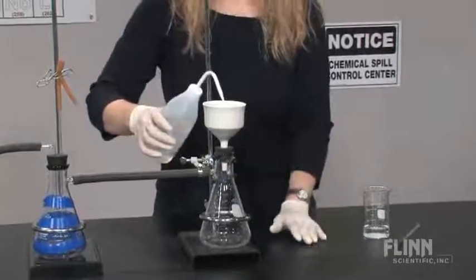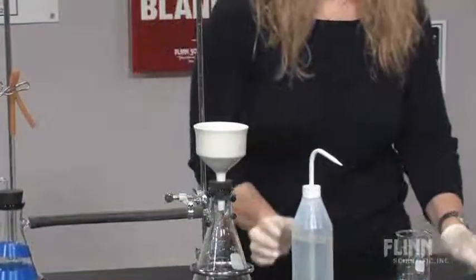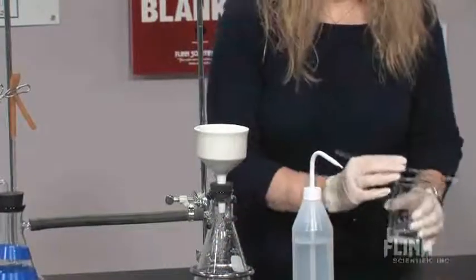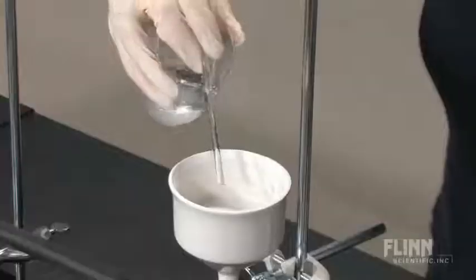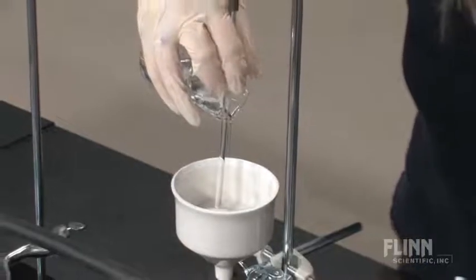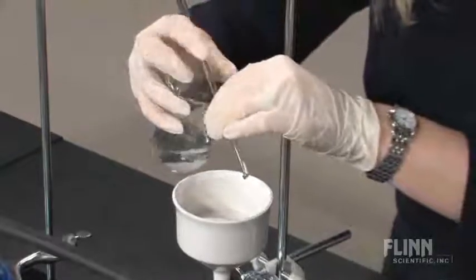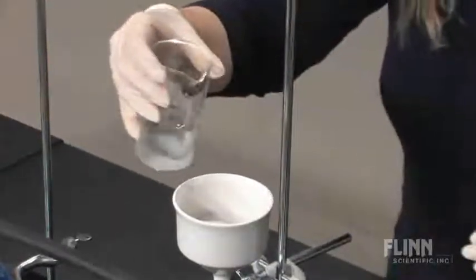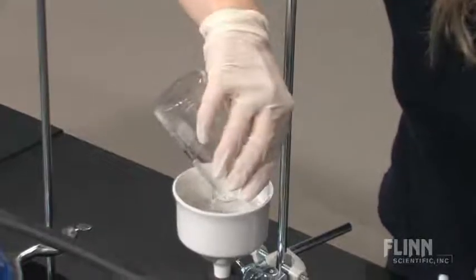For a high school lab this is usually water. Start adding the mixture right away before the filter paper dries. Decant about half of the liquid first by pouring it down the stirring rod onto the center of the filter paper. Stir the mixture and then pour the remaining into the funnel.